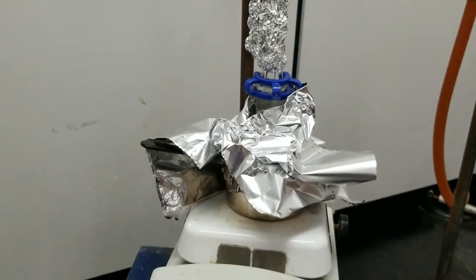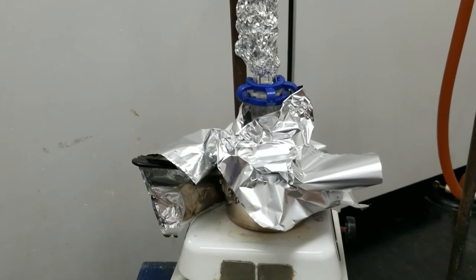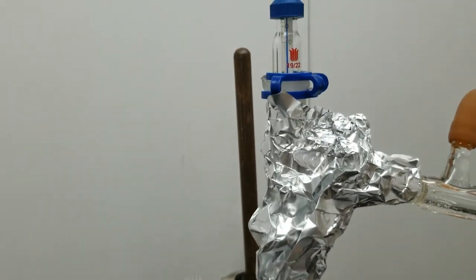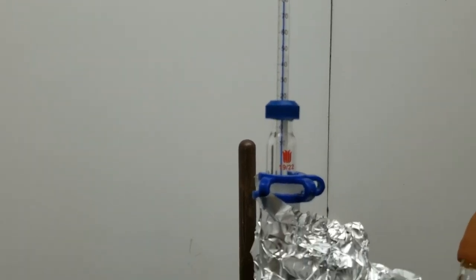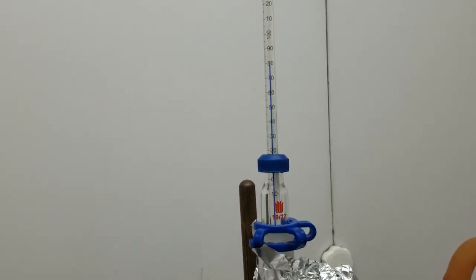Hello, everyone. So we're back after a few minutes of heating time. You can see that we've added some extra insulation in parts just to speed up the process. So the fumes have climbed the entire column, and now the thermometer is reading a healthy 77 or 79 degrees Celsius, which should correlate pretty closely to the boiling point of ethyl acetate.